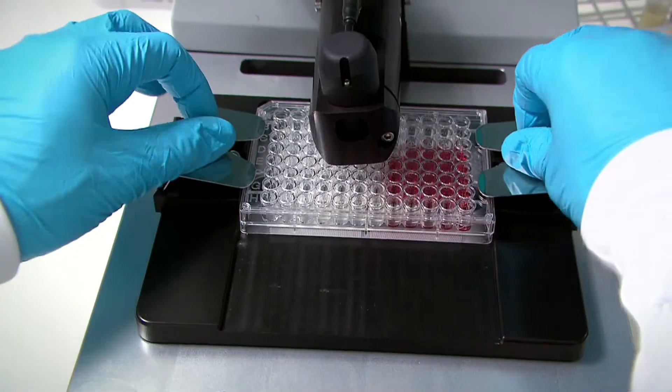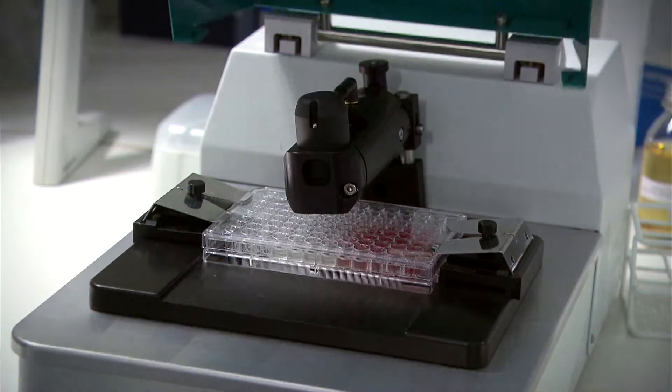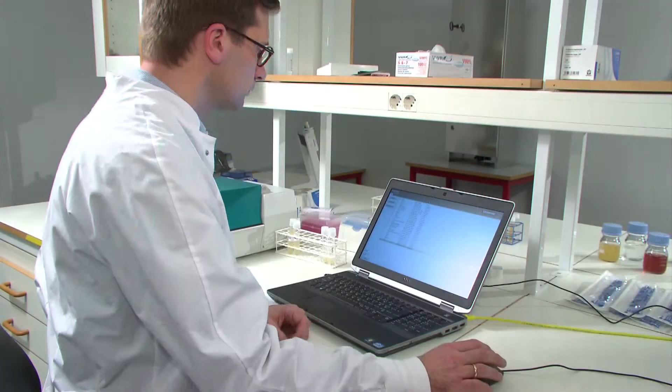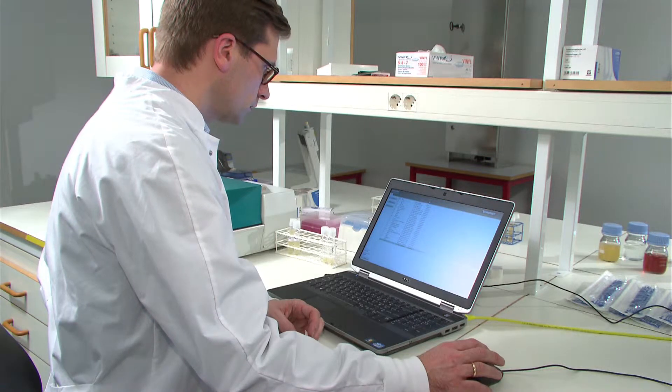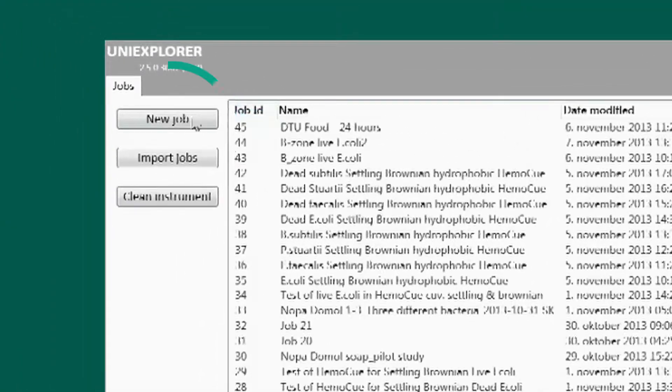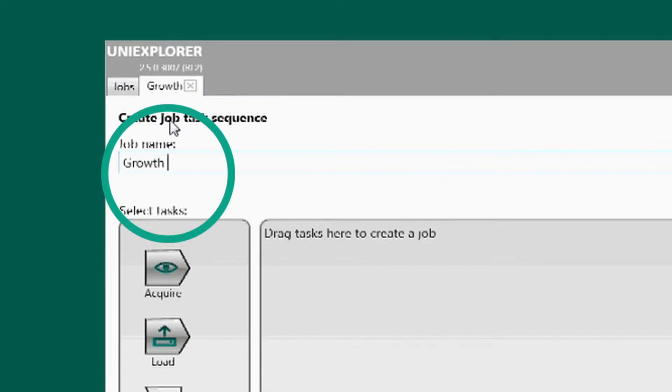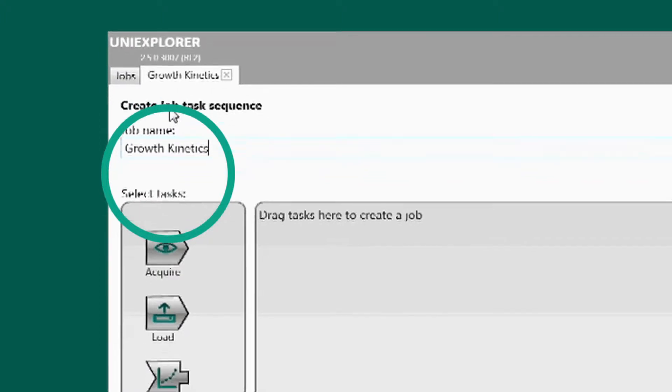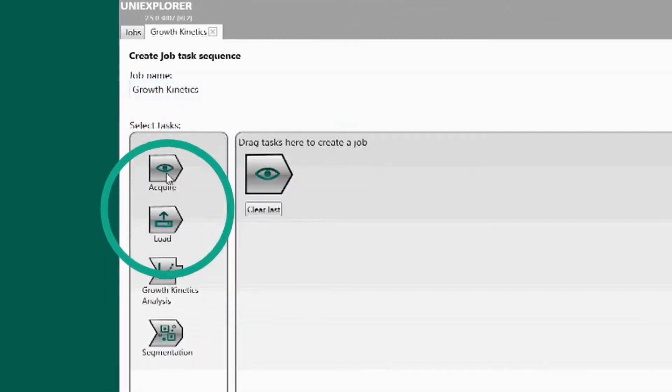The plate is carefully pushed into place and is then fastened. The UniExplorer program on the computer is then started and New Job chosen. The sample is given a name, then choose the Acquire module and after that the Growth Kinetics module.